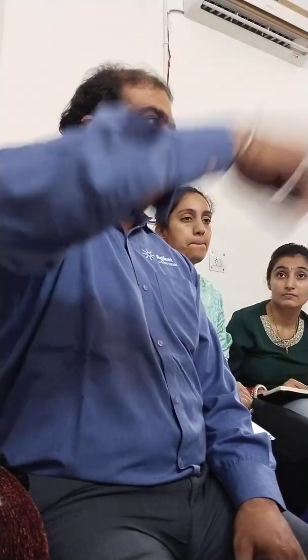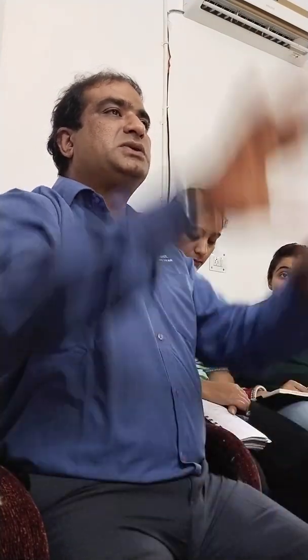Now, the question is how many precursors you can give at a particular retention time. Maximum 4, because with an increase in precursors, the efficiency of the quadrupole goes down. So I cannot put all 100 precursors without retention time. If I do that, you will miss everything. That's why I don't prefer targeted. Let us do auto, see the results, then we will go further.